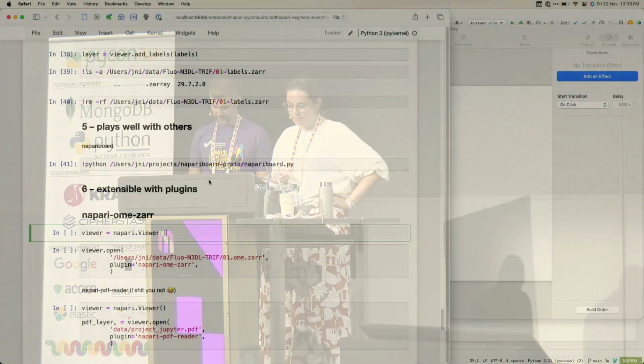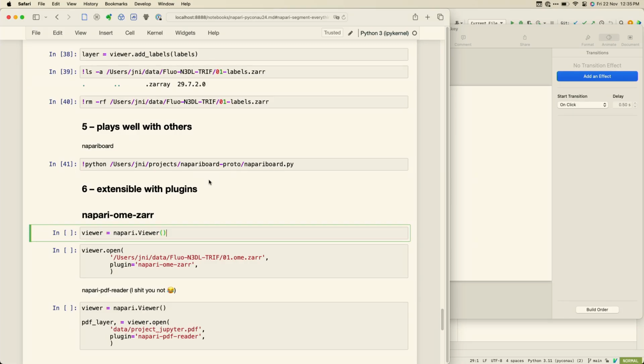So as Juan mentioned, what's really nice about napari is that you can have your notebook open, and you can write little scripts, and then you can have your viewer, and you can do some stuff in the viewer, and you can do some stuff in the scripts. But not everybody is comfortable with Python, and especially some of the biologists that work with it, or just some of the practitioners in general, don't want to write scripts and don't want to run them either necessarily. And plugins are napari's way of distributing this custom functionality that you've written for the viewer to other people via Python packages.